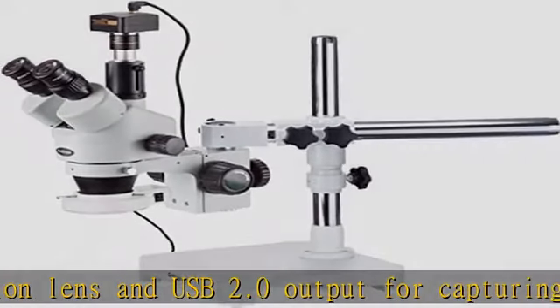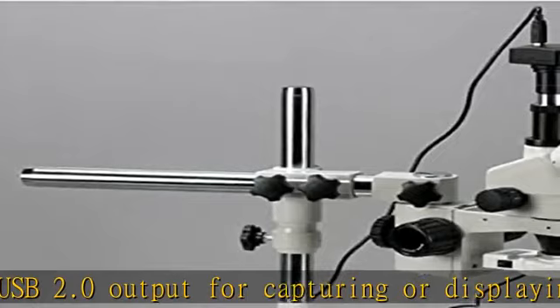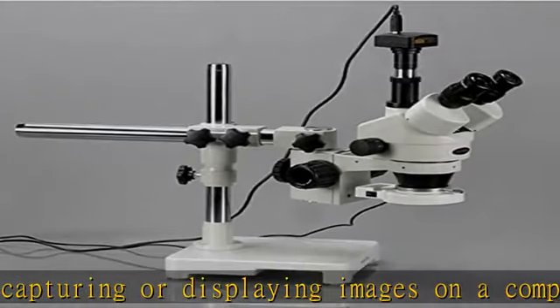Removable rheostat controlled 54 bulb LED ring light provides intensity control and bright, cool light for working with temperature sensitive or live specimens.